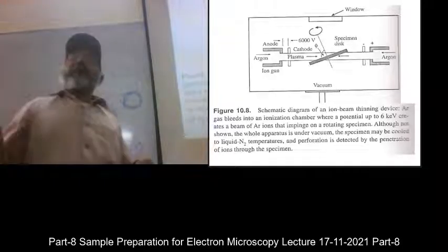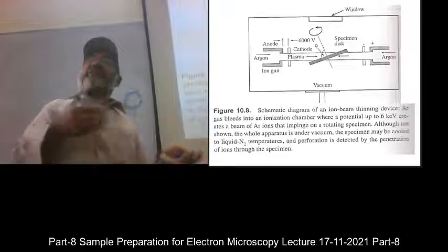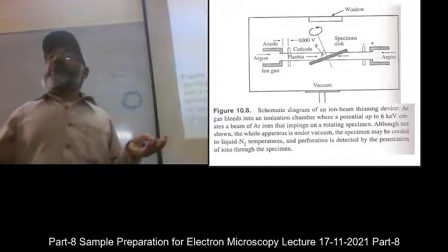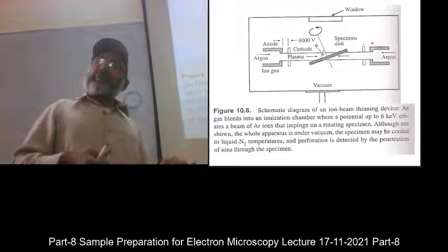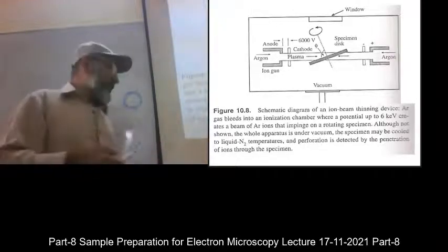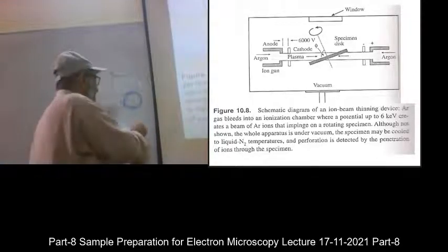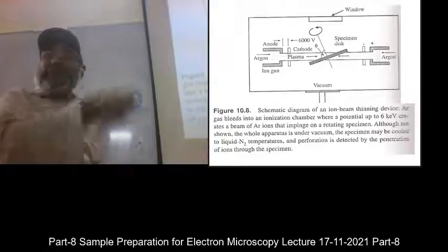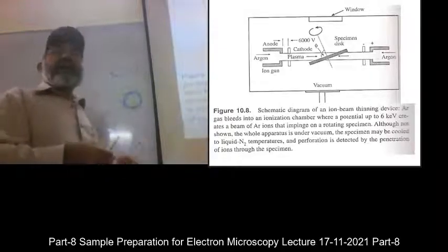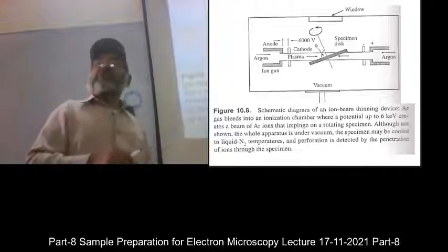For example, a monoclinic structure is transforming into a cubic structure, a cubic is transforming into a tetragonal structure, the diffraction pattern like this is becoming like this. So you see it. So it is in situ, I-N-S-I-T-U.